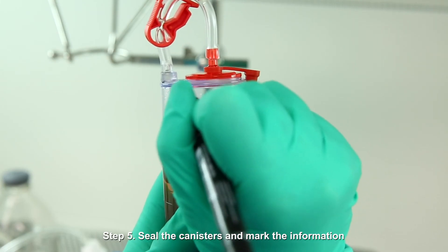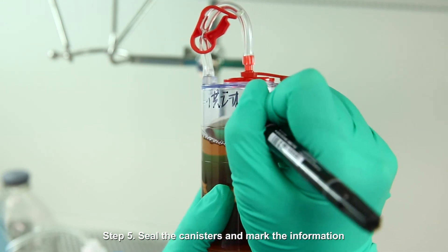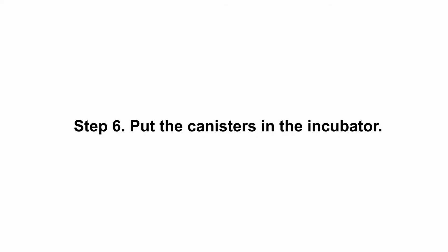Step 5: Seal the canisters and log the information. Step 6: Put the canisters into the incubator.